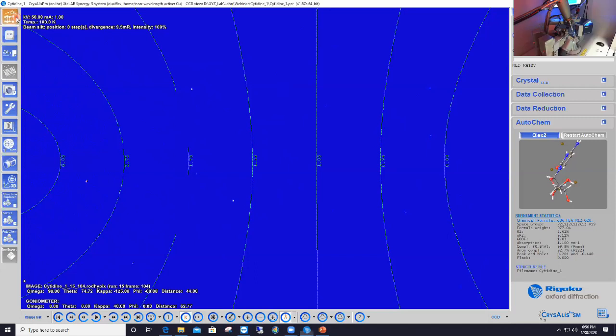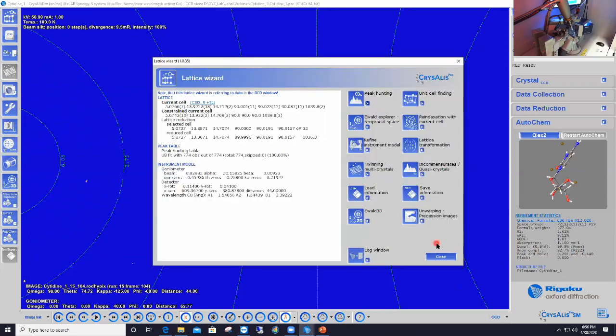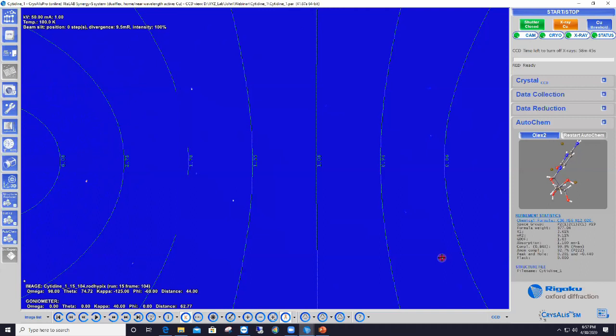So this is probably this older feature in the Lattice Wizard, unwarping here. Maybe that's what this person is talking about. But this is essentially replaced by the Ewald 3D here that reconstructs your diffraction pattern in 3 dimensions. So we rather use that one now rather than a 2D unwarping of the images. Oh, so you're asking for a precession image. Got it. Unwrap confused me. Okay. So we've answered that.